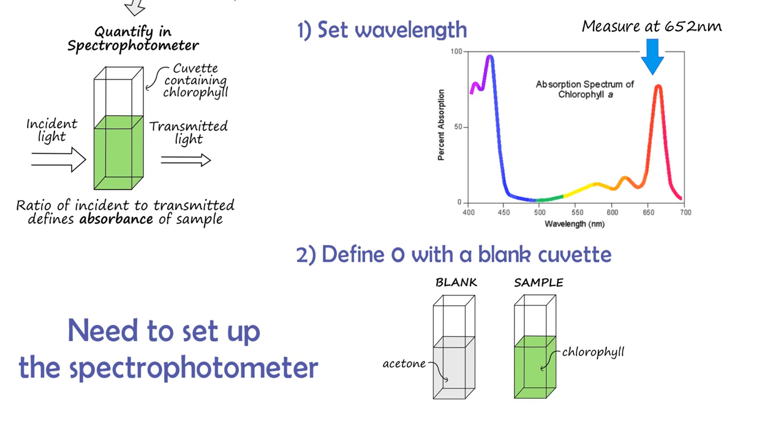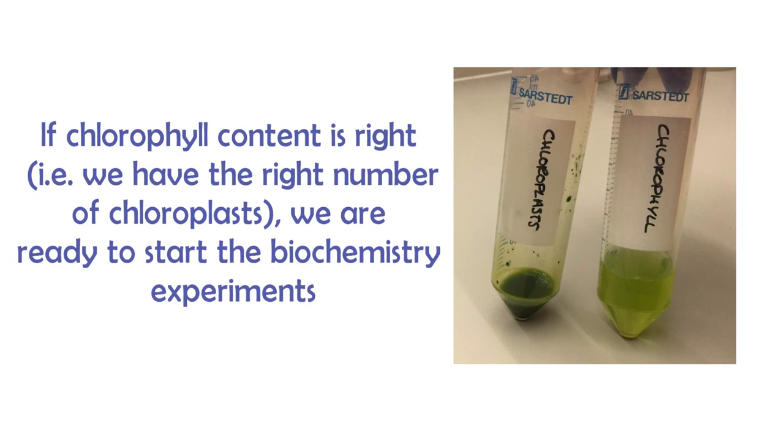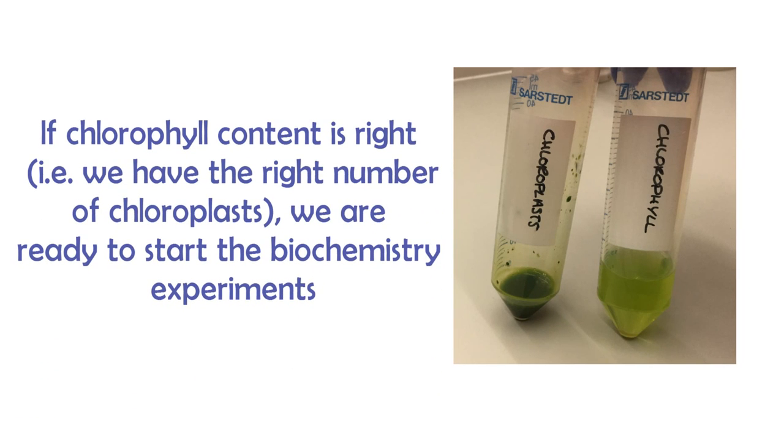This cuvette of acetone is referred to as a blank, and every time you set a new wavelength on the spec, you need to re-zero it with a new blank solution. Once we've checked the chlorophyll content of the extract is suitable for use, we can then move to the biochemical assay part of the experiment, which is described in another video.